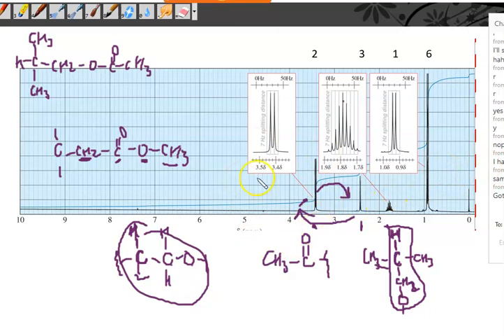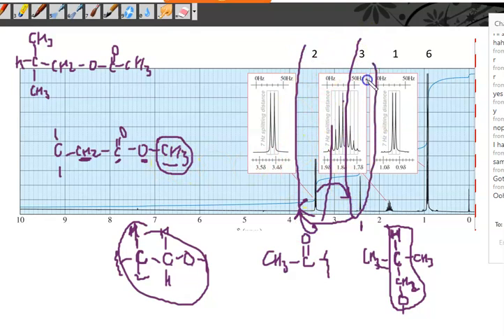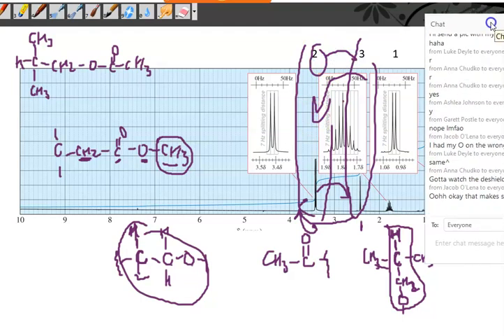So just try to go back and see that and see, okay, if I had this, this would be a singlet with integration of 3. It would be in this location right here. So this whole part of it would have been over there, and then this whole part would have been over there. Okay, good, good. I've got to watch the de-shielding.